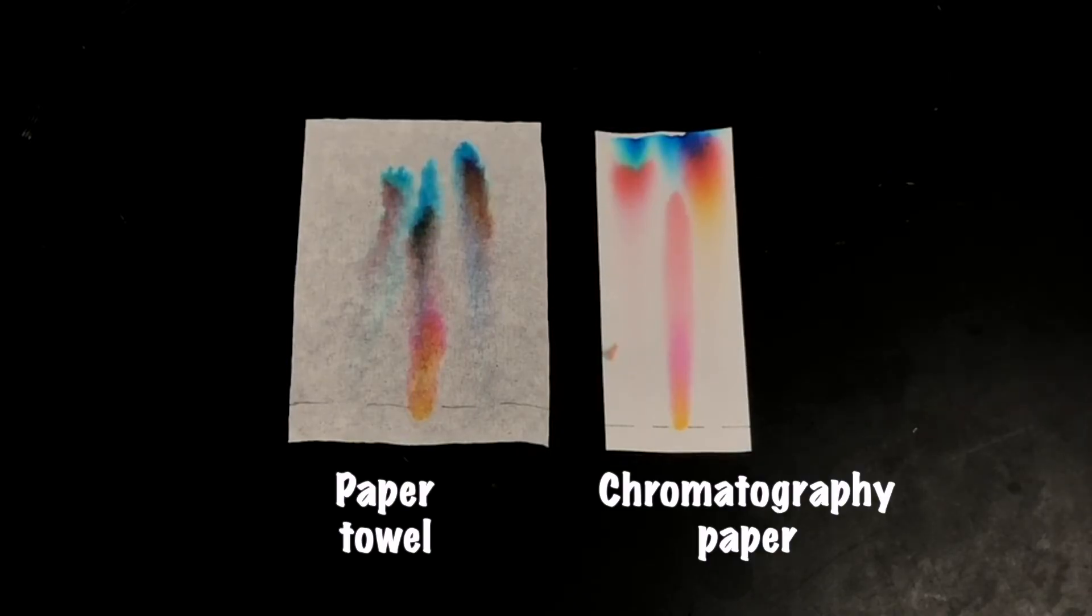The chromatography paper is a special paper that's designed to be able to separate different chemicals from one another. So we have a more consistent structure on the paper, which gives us a little bit more definition between each of the spots.